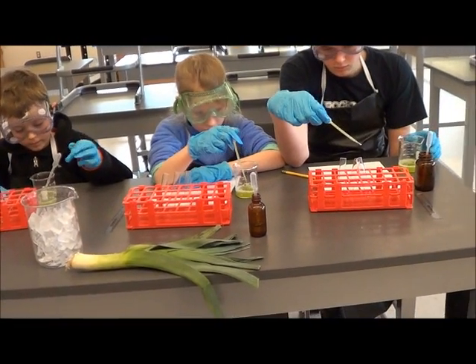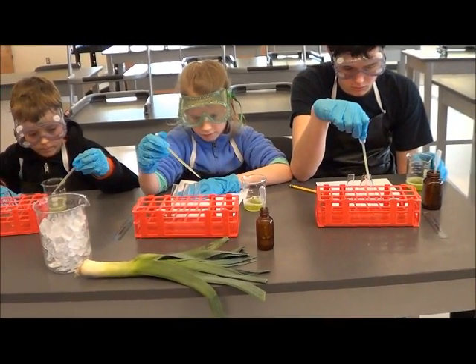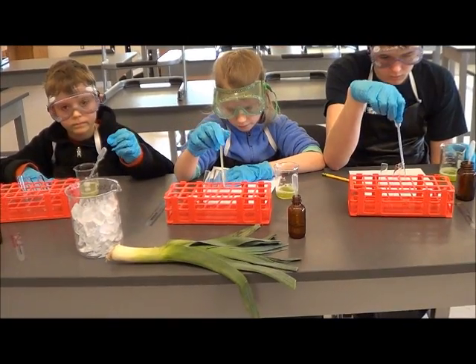Okay, now we're doing another experiment and we're putting one milliliter of catalase to start off in each of the three test tubes.